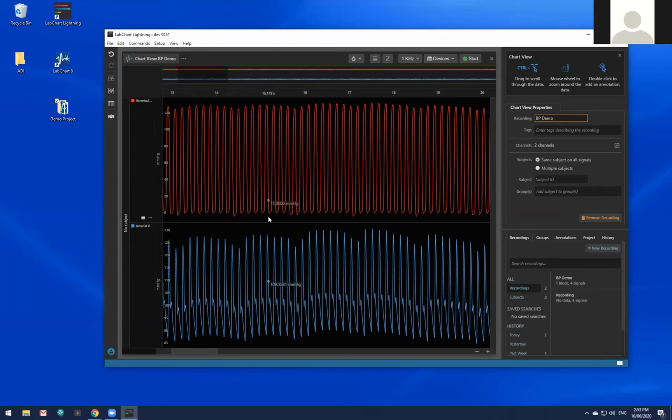A point of warning though: the calculations you made, such as cyclic measurements, won't carry over, and we don't have the data pad here. It's a whole new cross analysis table. Data pad won't be available here. It's a different variation, and your cyclic measurements or arithmetic won't be provided either. Those channels that did have those calculations will just be empty.